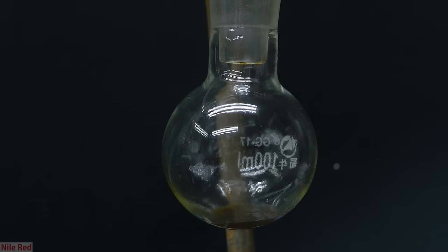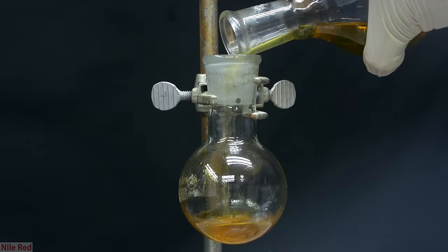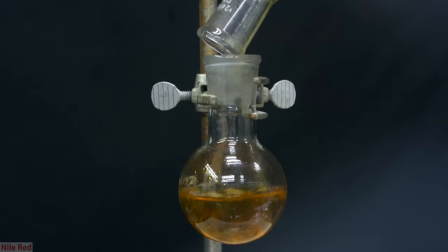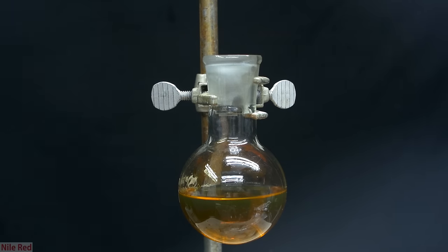You can see here how much I collected in the second part of the distillation, and hopefully you can see that it's not very much. To continue and to get our acetone, I combined the two fractions that I got from the distillation. The 250 milliliter flask was a little bit too big, so I decided to transfer everything into the smaller 100 milliliter flask. At this point, what we have is a mixture of water, acetone, and side products, and we're gonna have to distill off our acetone to purify it.